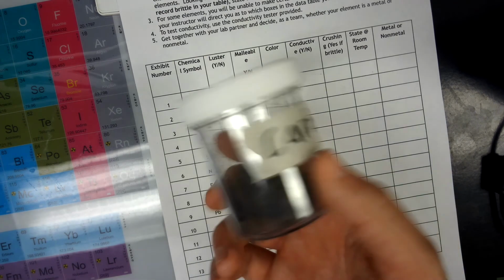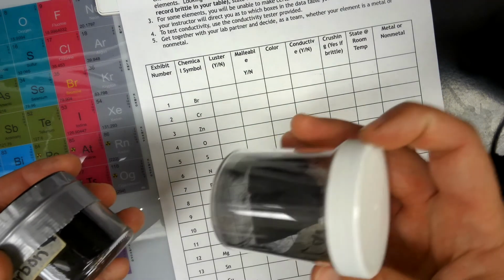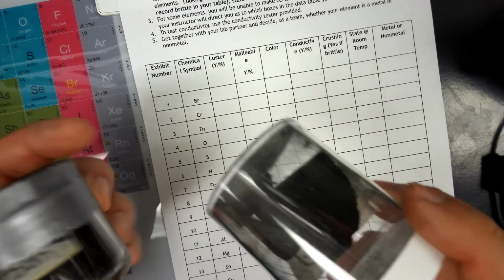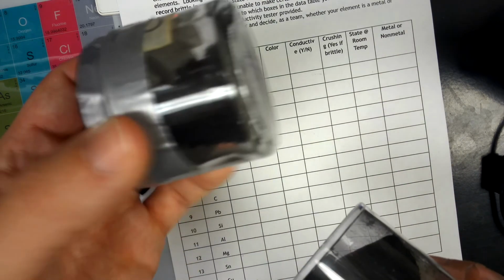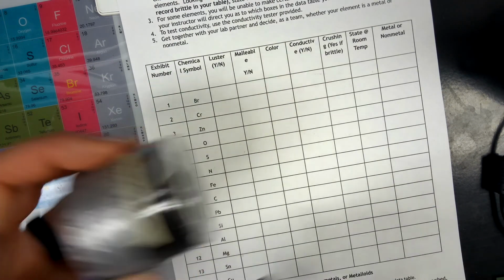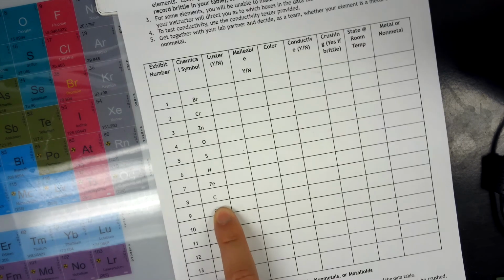Next up is carbon. Carbon's usually just a piece of coal or something. This is just a really loose piece of peat, I think. You can actually crush it up a little bit into smaller pieces, so I don't let students play around with this too much because it is messy. Carbon is number 8 on our list down here.